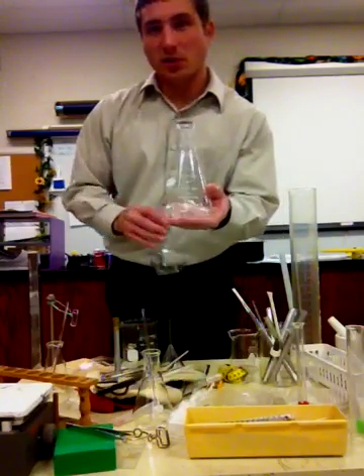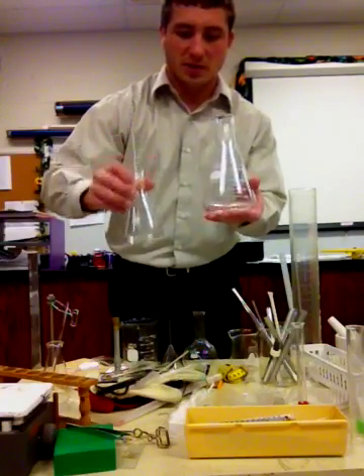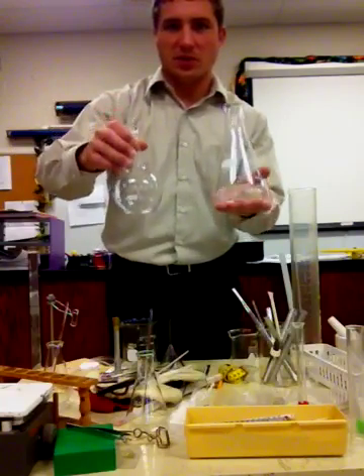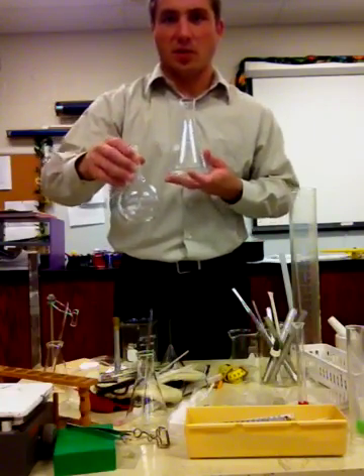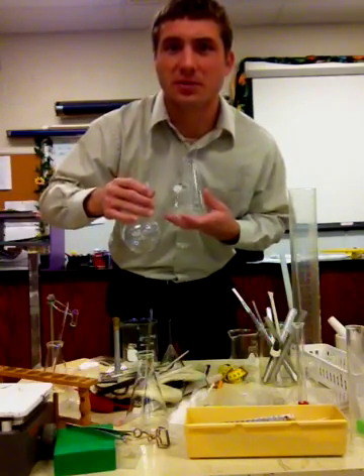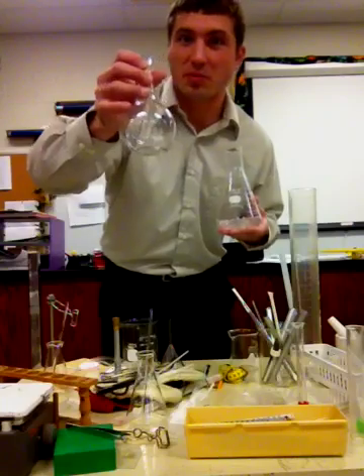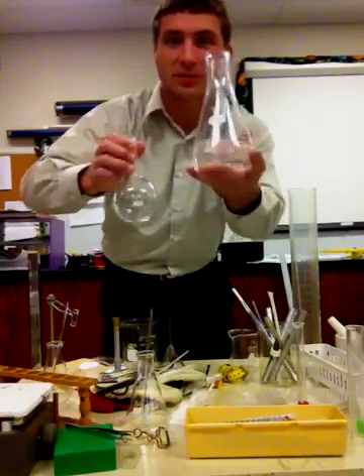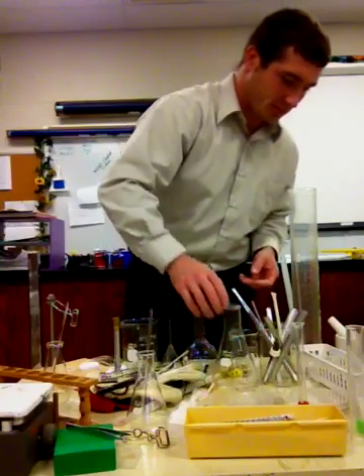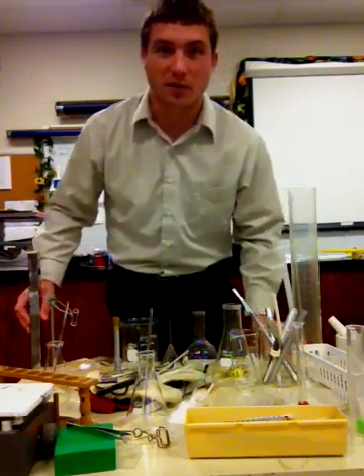This is the Erlenmeyer flask, and we have several different sizes of the Erlenmeyer flask. And this is the Florence flask. The difference: the Erlenmeyer, sounding like a male's name, looks kind of like a tie. And the Florence flask has a rounded bottom. And that concludes Session 1 of Lab Equipment.